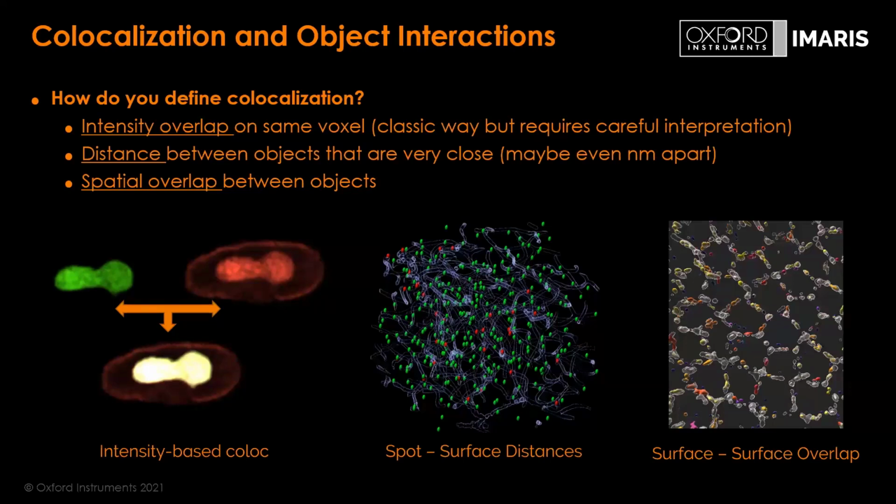Because colocalization is always a sensitive topic. There are multiple papers out there talking about bias and colocalization and whatnot. And it's impossible to reduce the bias to zero, but we have those software tools to reduce the bias as much as possible.